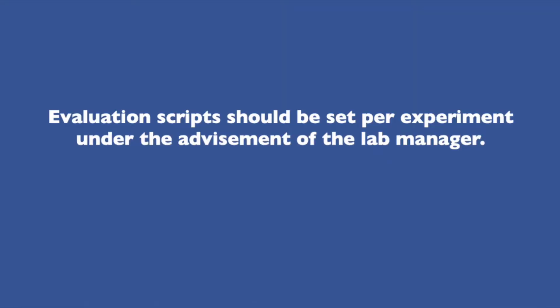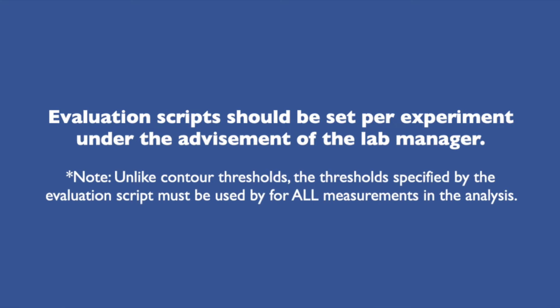Evaluation scripts should be set per experiment under the advisement of the lab manager. Note that, unlike the contour thresholds, the same evaluation thresholds must be used for all measurements in the analysis. We will have a separate instructional video explaining the process of choosing appropriate evaluation thresholds that will favorably align with all samples in an experiment, not just in a single measurement.